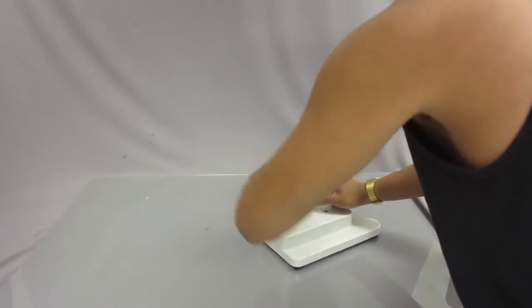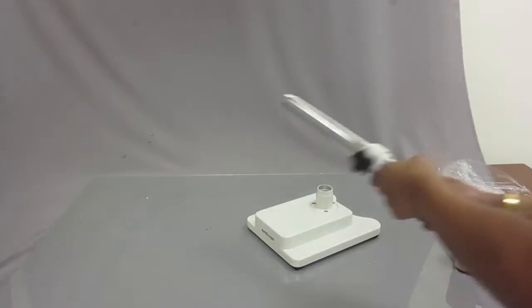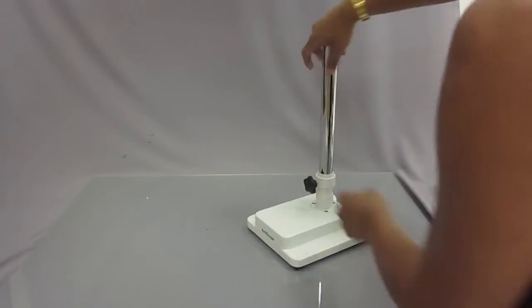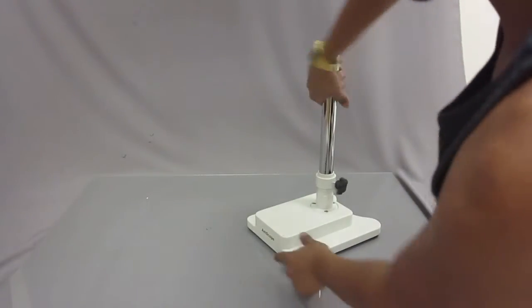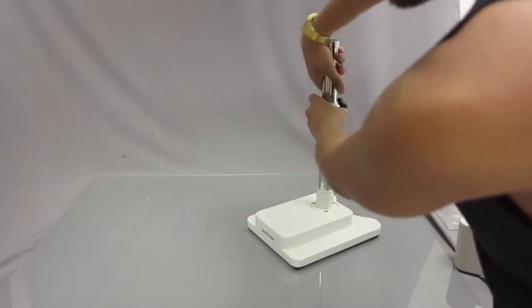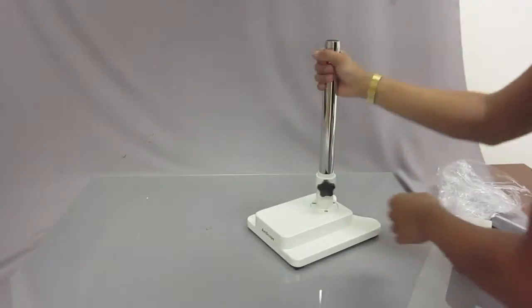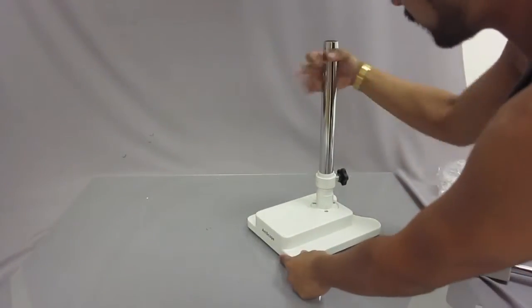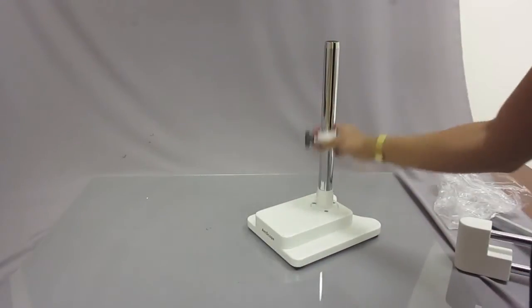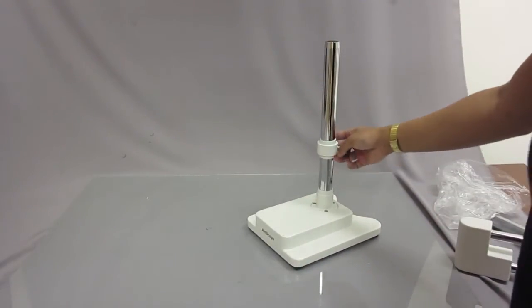First things first, get the base of the stand — the front is where the AmScope logo is. Take the long pole and screw it right into the bottom. Make sure that you screw it until it stops completely. Now that's secure.